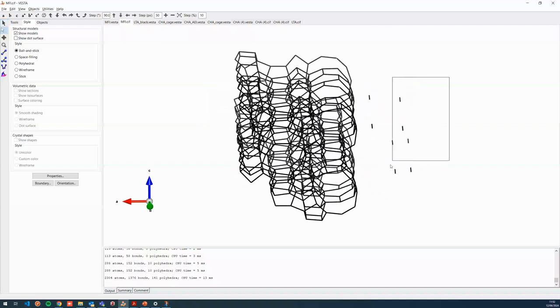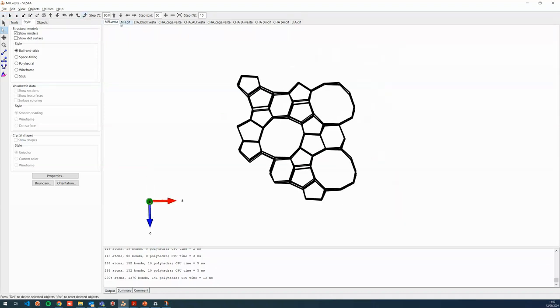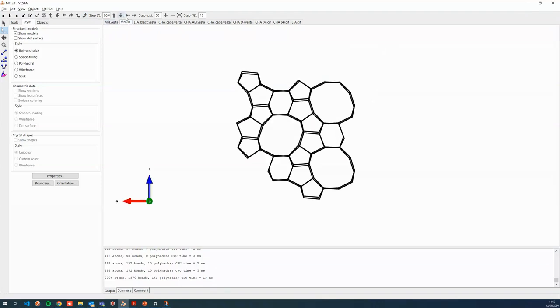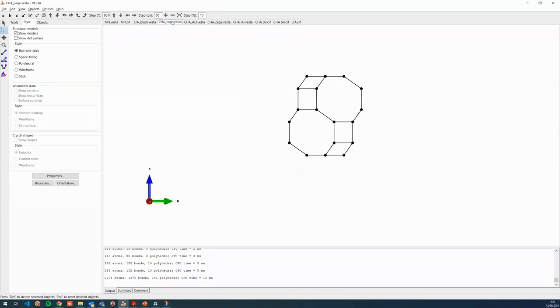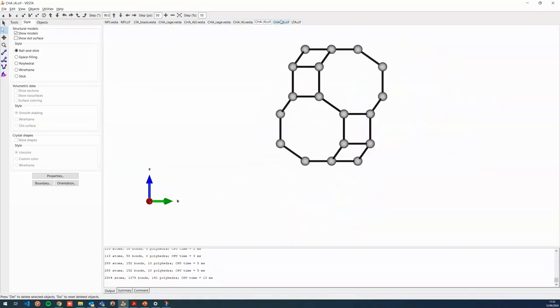You can see here on the side there are some parts we didn't remove. You can delete them as well. But yeah, so let's make it exactly the same. There you go. This is the same picture, and again, you can quite easily and fast really make very nice figures. Most of the time you spend really is on changing how they look.